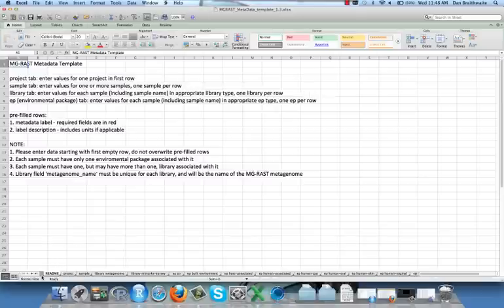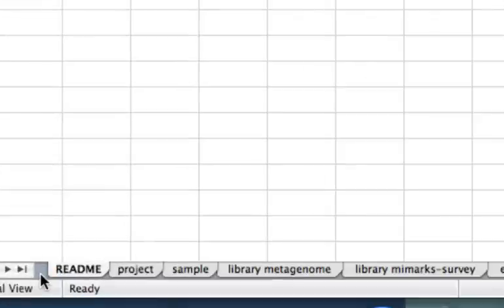Notice the tabs for each sheet. After the sheet called README, there are sheets named PROJECT and SAMPLE, and multiple LIBRARY sheets. And after that, the rest begin with EP, which signifies ENVIRONMENTAL PACKAGE.